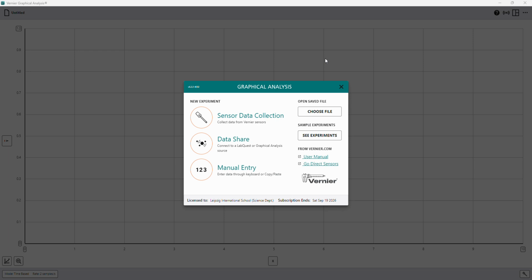I wanted to make a video and talk to you a bit about the Vernier Graphical Analysis, the software that we've all been using for the past few months, and a main tool throughout your IB journey. I will try to cover every function of the software that you will need during those lab reports and essentially your IA next summer, with a few exceptions, as some of you might use some extra functions for specific tasks that will not be covered in this video, or for your EE.